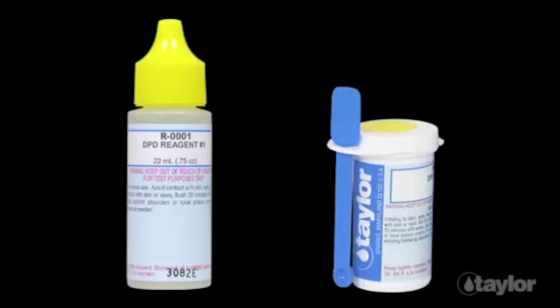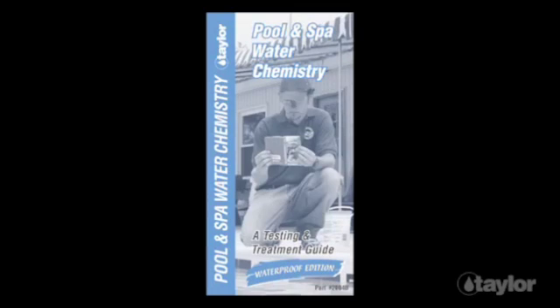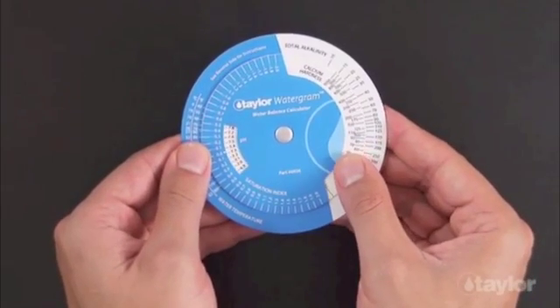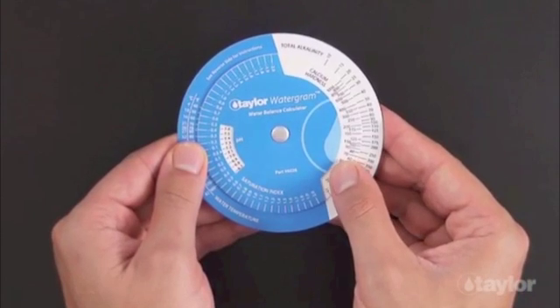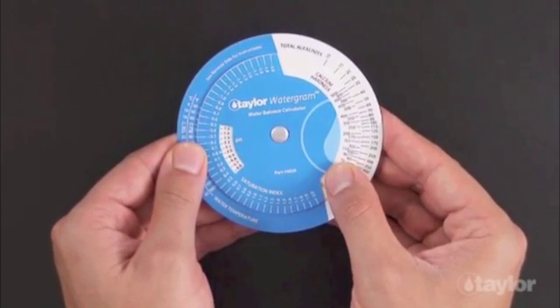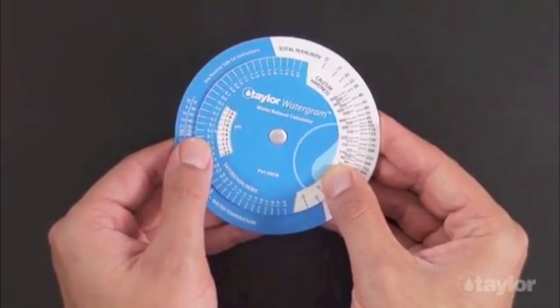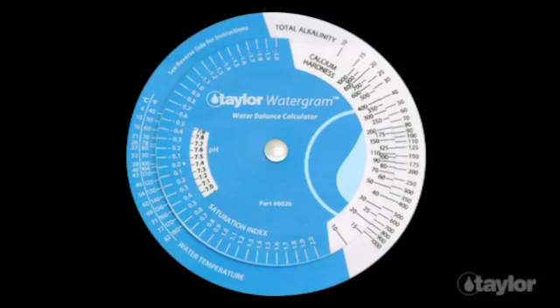The DPD powder is in a 10-gram vial. The kit also includes a comprehensive testing and treatment guide, plus Taylor's unique watergram. The watergram makes quick work of the math needed to determine whether the water is becoming corrosive or scaling. It is a great tool for deciding which aspect of the chemistry to change when the water is out of balance. You can try several treatment scenarios before using any chemicals.